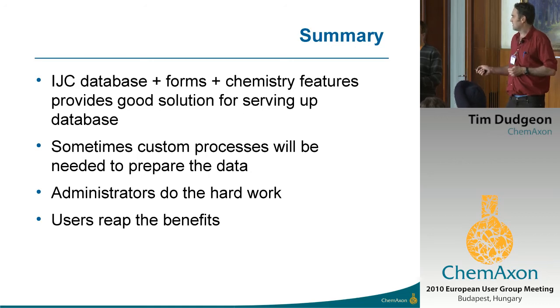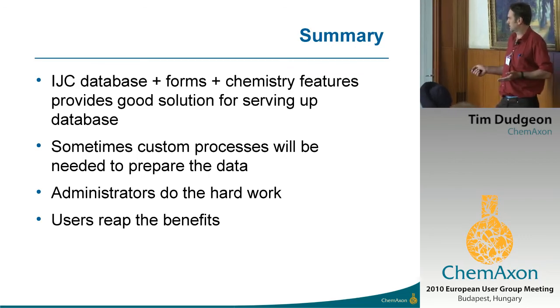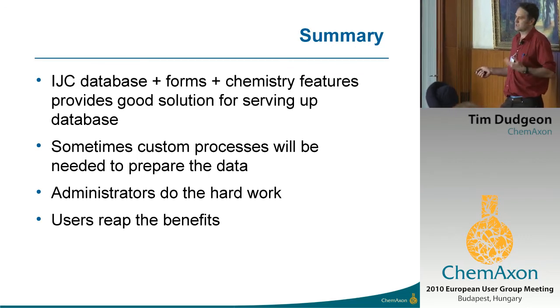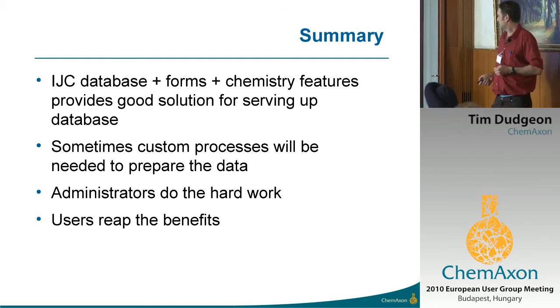Basically what happens here, you let the administrator do the hard work, and you can then still serve up your data to your users and let them use all the standard IJC features to actually search the databases once you've prepared them. Okay, so that's it.